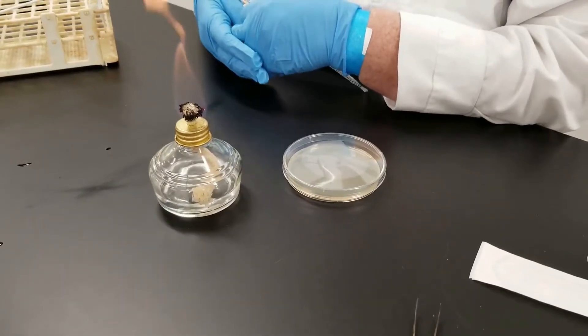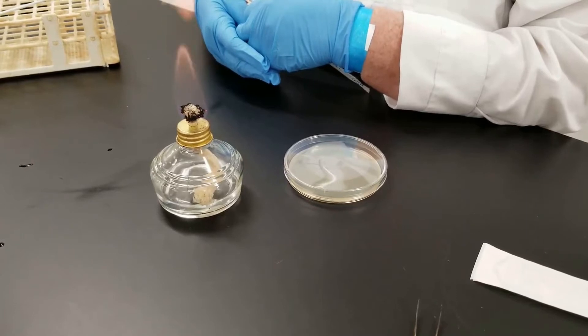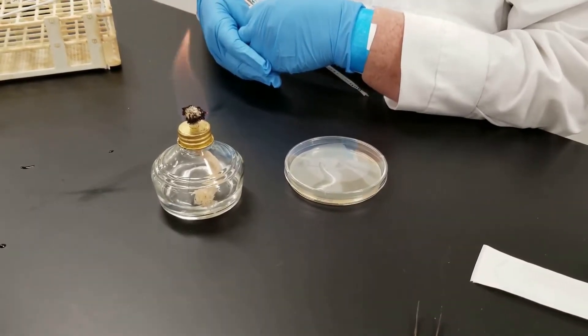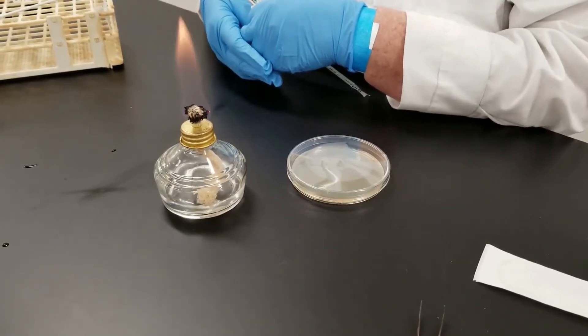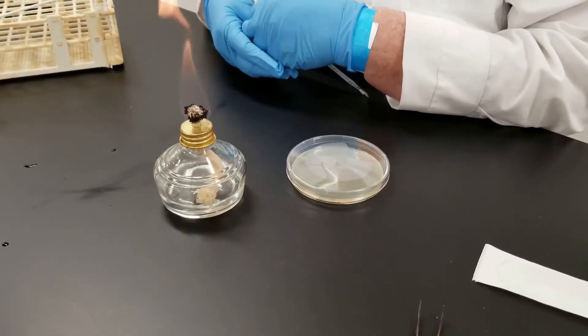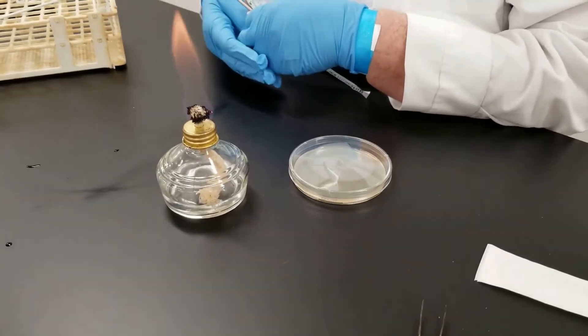In this experiment, we are testing the effects of different antibiotics on different bacteria. We're going to have two plates. One will be inoculated with a gram-positive bacteria, which is Staphylococcus aureus. The other one will be inoculated with a gram-negative organism — we will use E. coli.